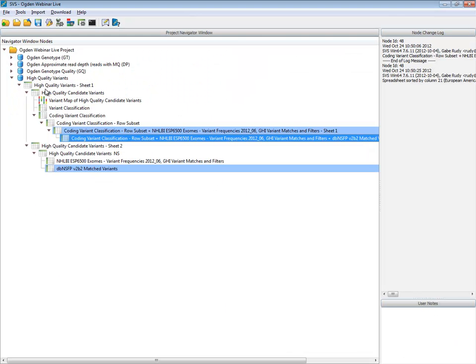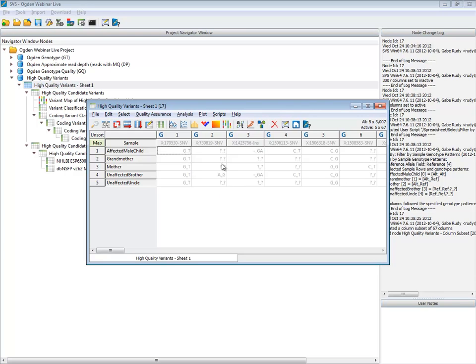You would have a single VCF file that fills in with reference where there is supporting evidence for a genotype, and with missing when there are no reads to cover that genotype. That is obviously preferable, but at the end of the day, genotype callers are still going to have problematic areas, so you can't treat that as a silver bullet either. There still has to be follow-up in Genome Browse, etc., to really validate any putative variant.